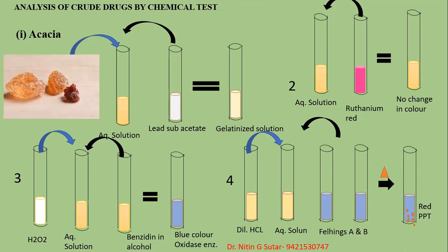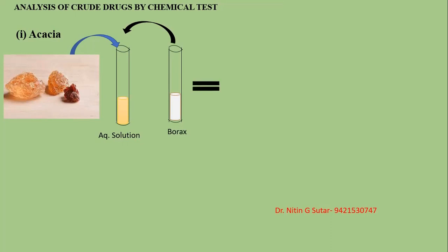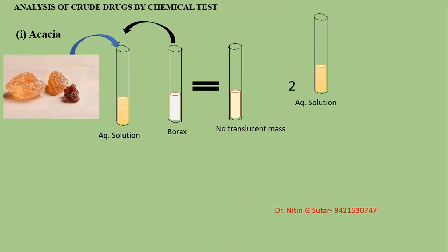These are the four tests for acacia. For the next test, prepare the aqueous solution of acacia and add a small quantity of borax to it. No translucent mass is formed — that indicates acacia is present. In some other drugs a translucent mass is formed, but in the case of acacia with borax, no translucent mass is formed.